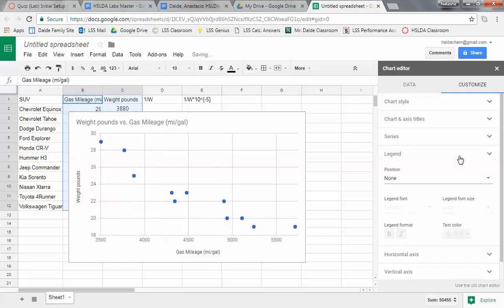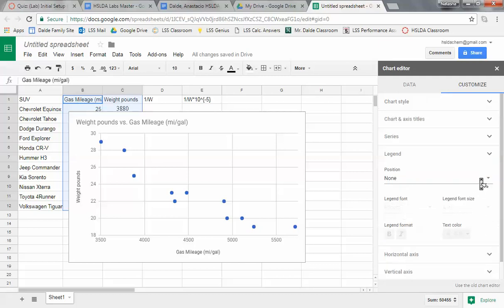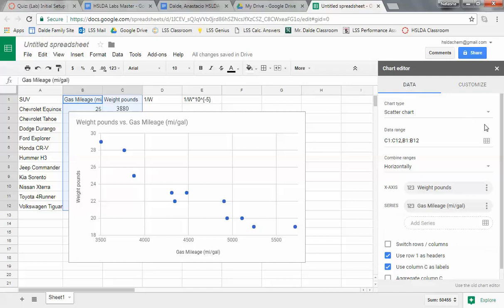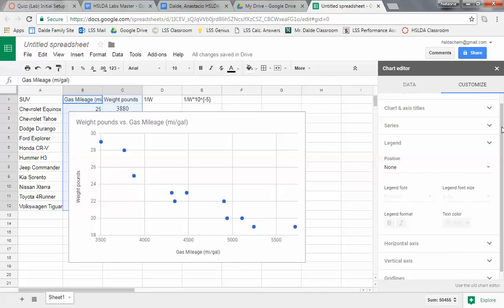It says, draw a smooth curve through the midst of the points. I don't have a ruler. I guess I could print it up and draw it physically, but there's this nice little feature. Let's see, I wonder if I have it under data. Gosh, I remember where it was, but now I need to find it again.